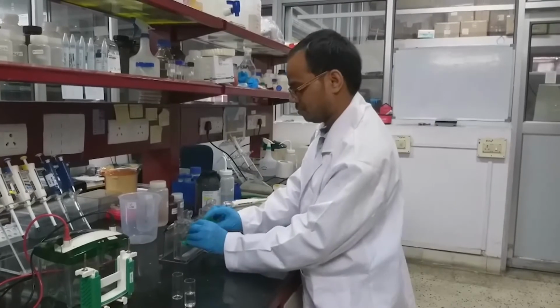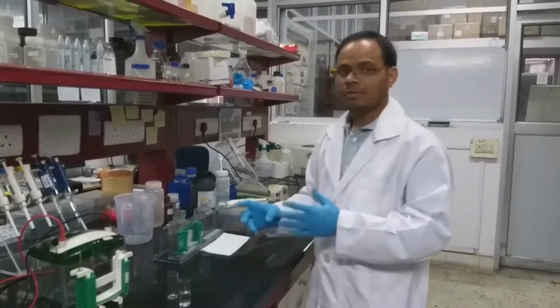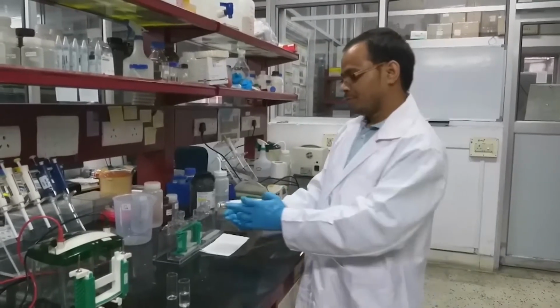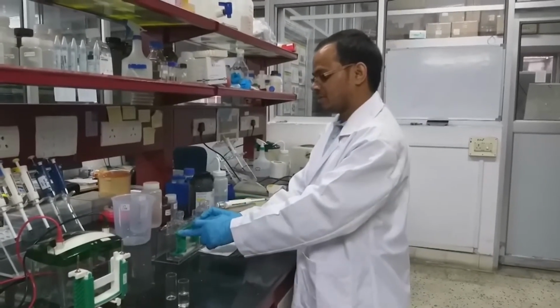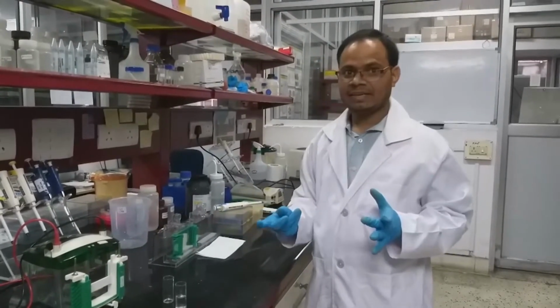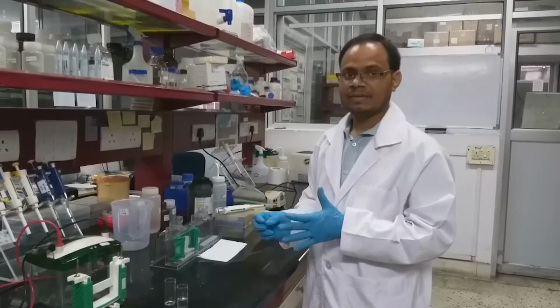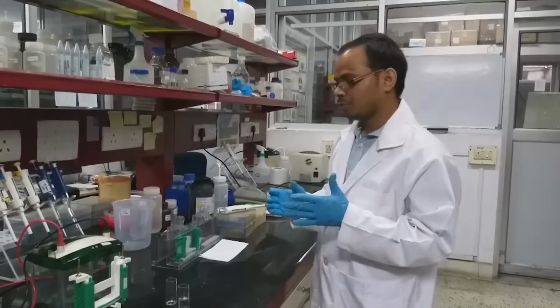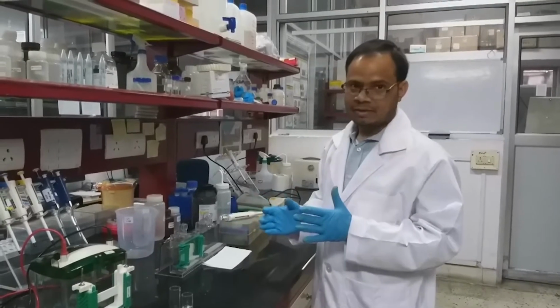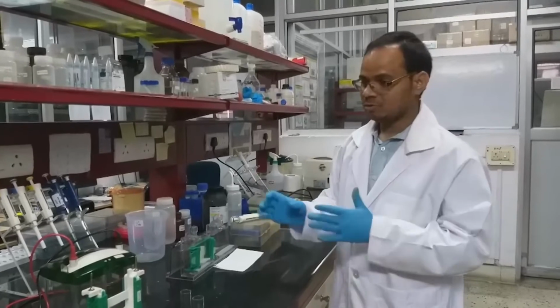Then we are going to keep it like this. So we have to check if we perfectly set up this one, then there should not be any leakage. But if there is any leakage, your resolving gel may leak out and you will get nothing. So in that case, we have to check it prior to pouring the gel, whether it is okay or not.